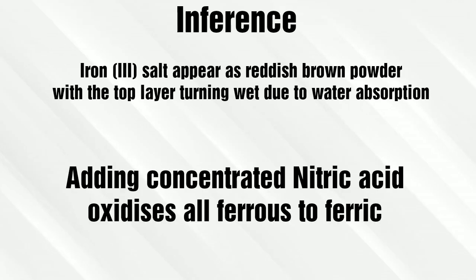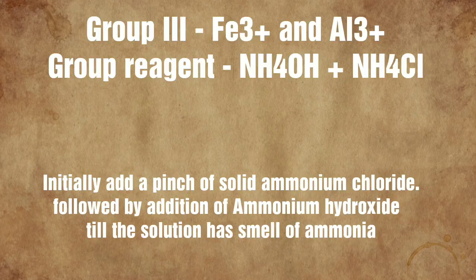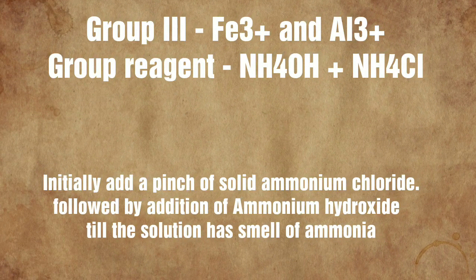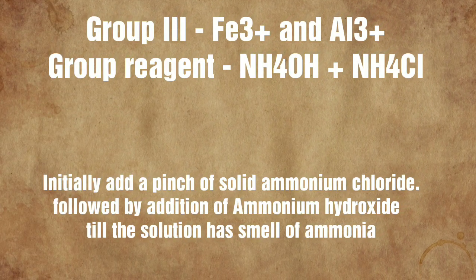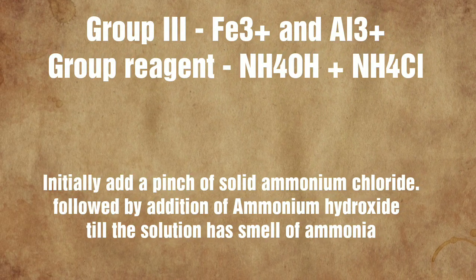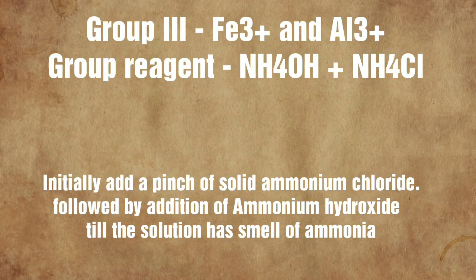The iron 3 salt appears as a reddish brown powder, and adding concentrated nitric acid to it gets oxidized to ferric form. Now we add the group reagent. Iron 3+ and aluminium ions belong to group 3, and the group reagent is ammonium hydroxide in solid ammonium chloride.